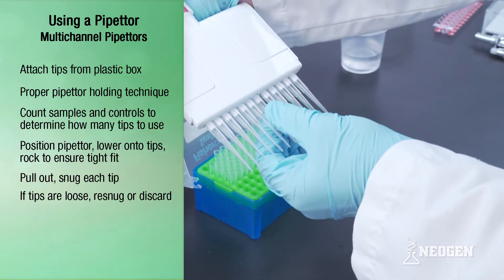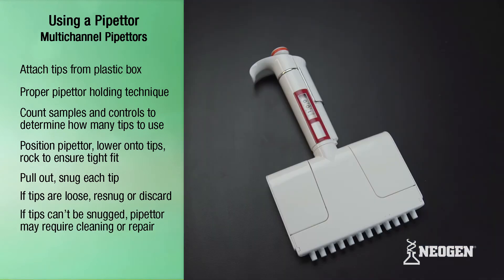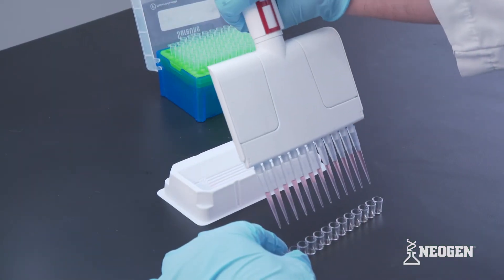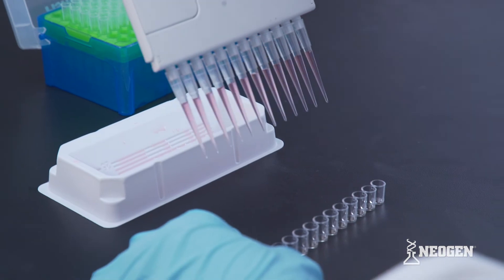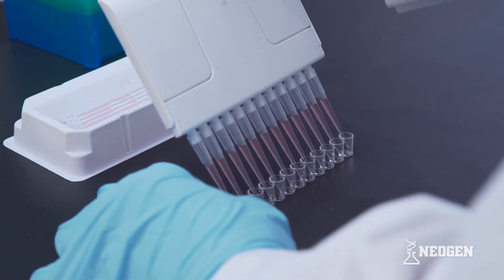If tips are loose, re-snug or discard and attach new tips. If tips can't be snugged, the pipetter may need to be cleaned or repaired. There are different methods to ensure the correct volumes are dispensed with these pipetters. Any of these methods are acceptable as long as good technique is followed to ensure consistent, accurate liquid volumes are dispensed. The different methods include forward technique and reverse technique.